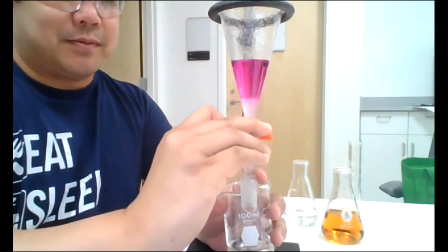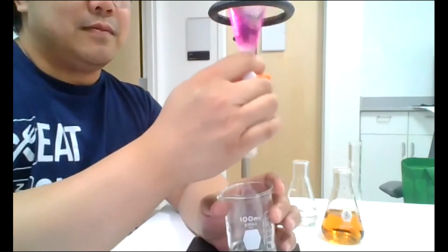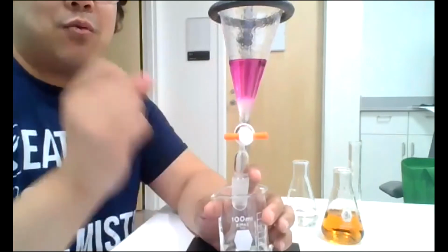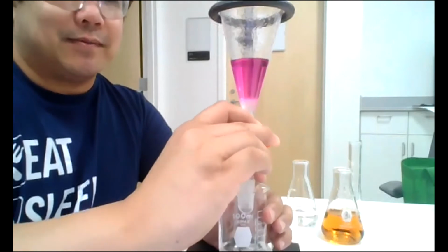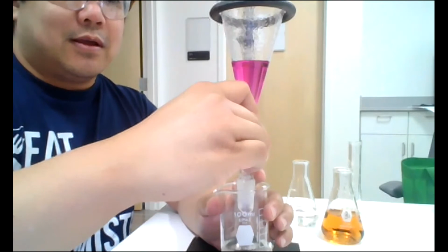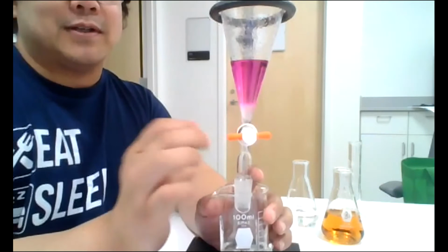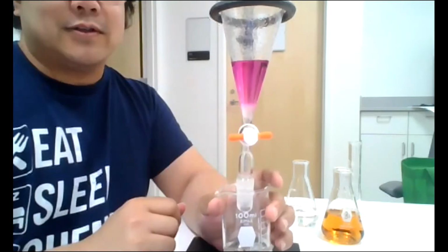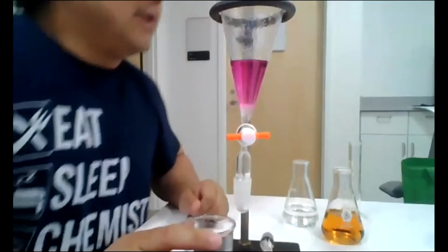I'm draining it into a beaker, and this represents extracting the aqueous layer once with one serving of 20 milliliters of cyclohexane. That's the first part of the experiment. Now, I'm not going to get every single drop of the aqueous layer because I don't want to accidentally get some of this organic layer. So I'm going to stop short, but I do have quite a bit. Okay, and I'm going to put that into a test tube.